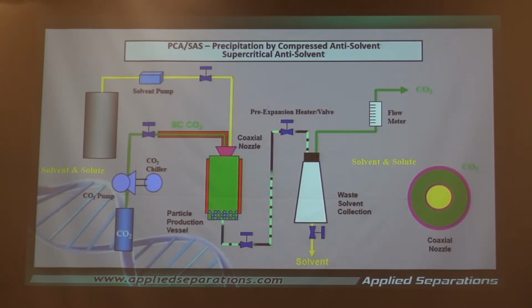Now, the important part is the mixing and the interface that you get with the nozzle. Just another technique. We're still using the anti-solvent technique here, but what we're doing is causing different mixing. What this does is not only change the size of the particles, but it will also change the morphology of the particles. Depending upon the nozzle you use and the size and configuration of it, this will change the morphology of the particles as well. Without going into a whole host of different nozzles, which is outside the scope of this talk, you can go into the literature and see some of these.